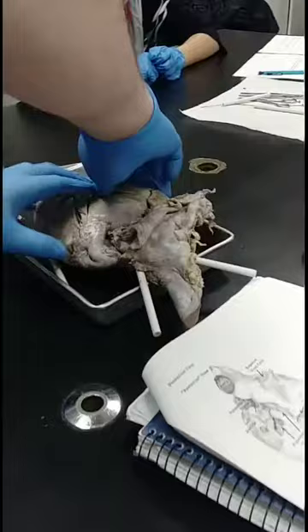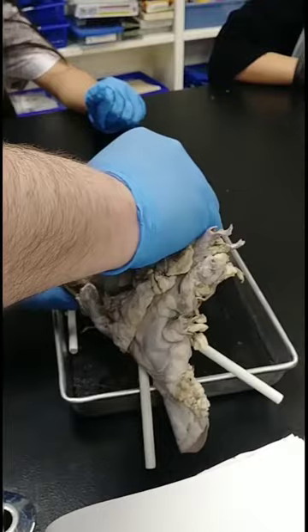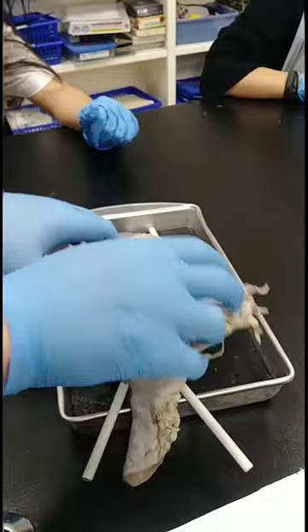Be careful. I made the big cut for you. Open up more of the right ventricle. Open a little more of the left ventricle so you can see what's going on. Be careful when you cut up here that we don't damage the atrium or auricle. We want to be able to see how they connect, and we'll see how all the arteries and veins connect to those chambers. Make sense?